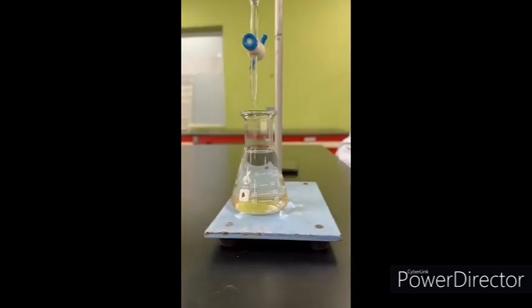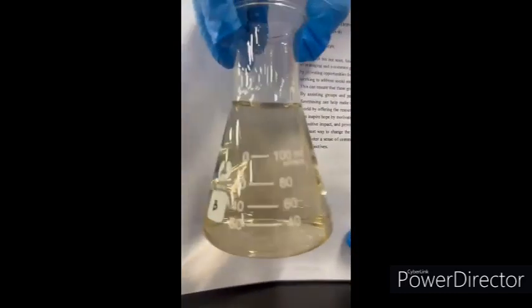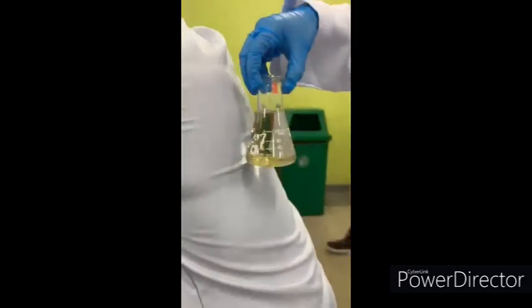To conclude, based on the first and second titration using the hydrochloric acid and sodium hydroxide, the onion extract works equally and as accurate as the pH indicator.